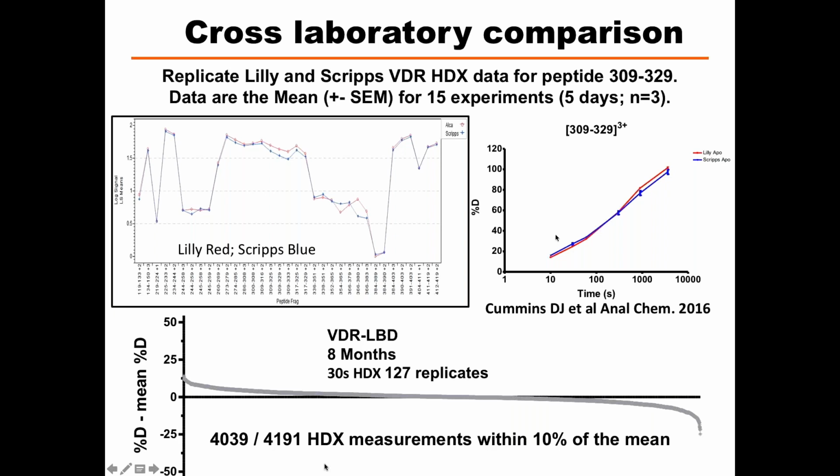It would vary from lot to lot if there was some influence on the protein. This was done with the same sample lot, but this is really the basis for companies using this to look at antibody production and bioprocessing.